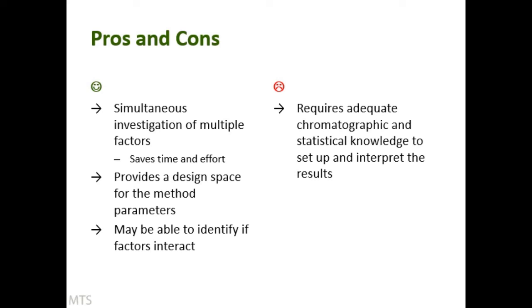You need to really understand chromatography and how the particular type of HPLC you're using works, because you have to select factors, which thing you're going to investigate, like pH, for example, or temperature. But you also have to decide on the range you're going to investigate. So that requires a lot of knowledge. But the other thing you need knowledge about is the statistical software as well. So that's quite challenging.